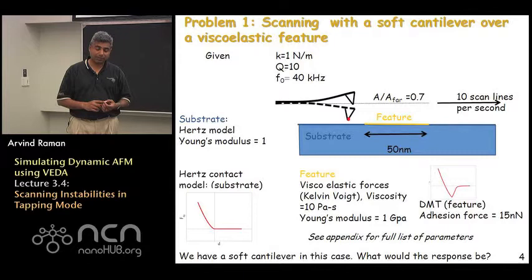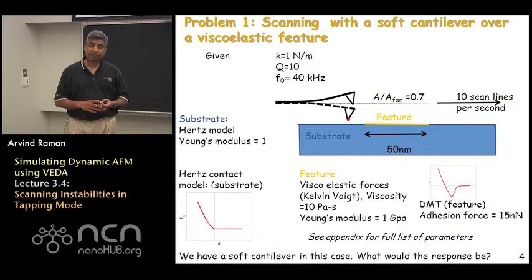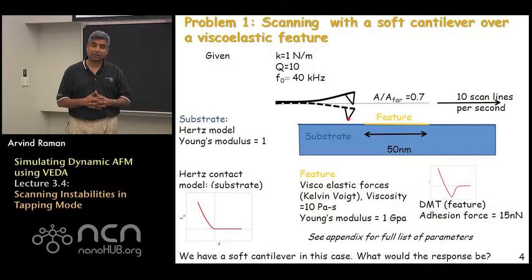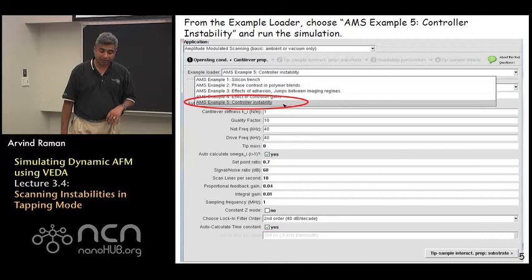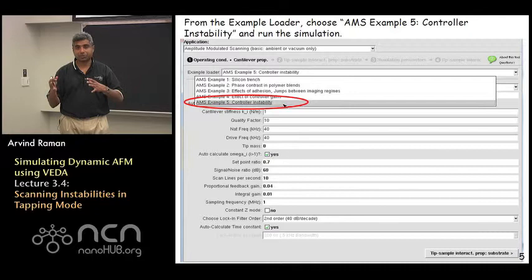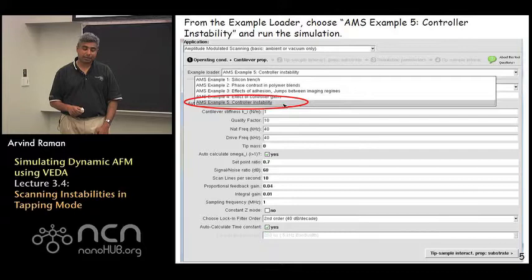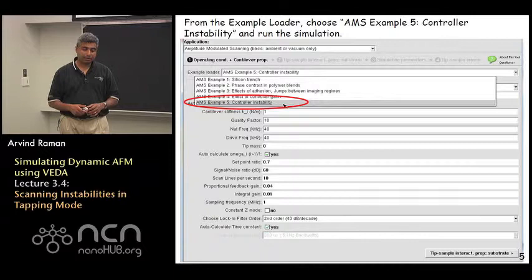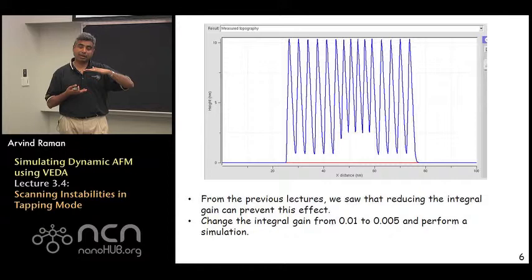And we want a set point ratio of 0.7, so 70 percent, and we are going to scan fast at 10 scan lines a second. And the amplitude far from the surface is 6 nanometers and we would like to understand how we are able to scan this nominally flat sample. So if you go to VEDA and choose example number five which is controller instability, all these parameters and feature properties are already loaded. So you pretty much have to just change the feedback controller, the proportional gain and the integral gain if you need to. And then hit the top right button to simulate and the probe actually approaches the sample on the substrate, reaches the desired set point amplitude and then starts scanning, goes over the feature and tries to go over the feature.